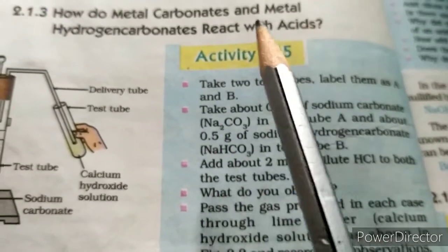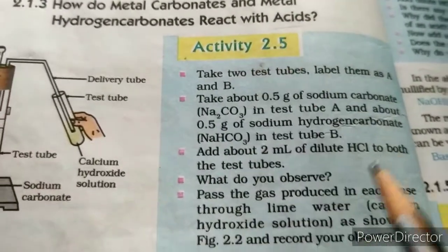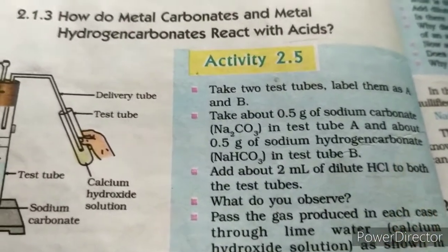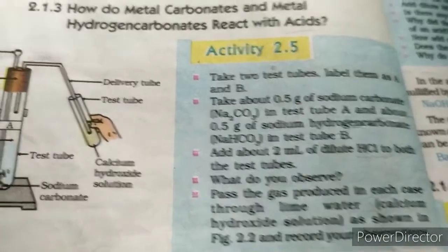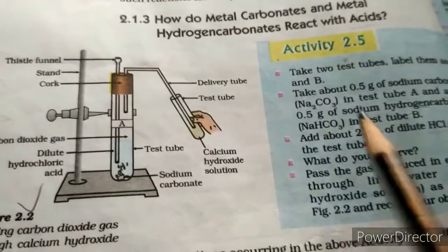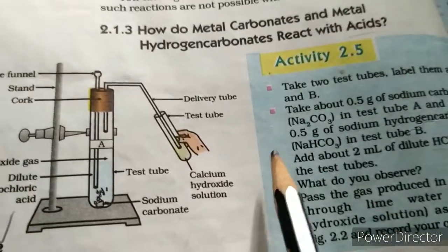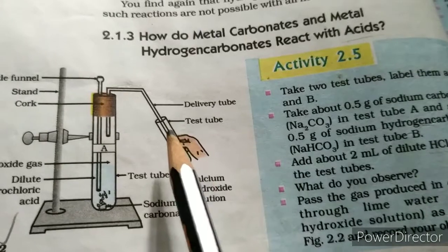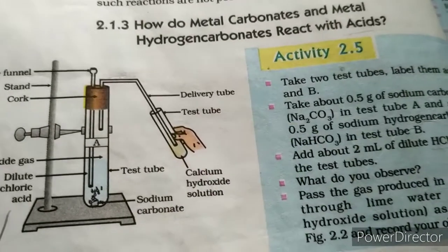And you need an acid, so the acid is taken as hydrochloric acid. To do this activity we have to prepare freshly prepared lime water in another test tube.